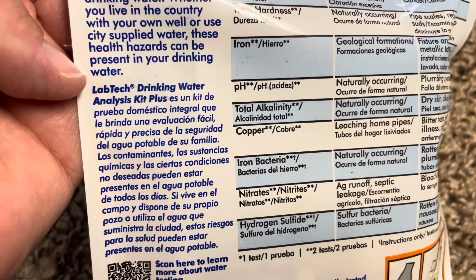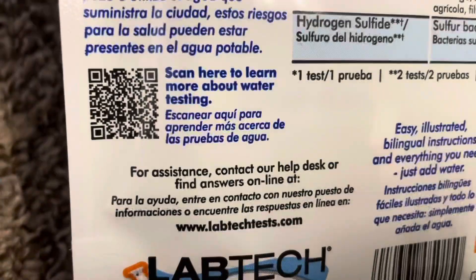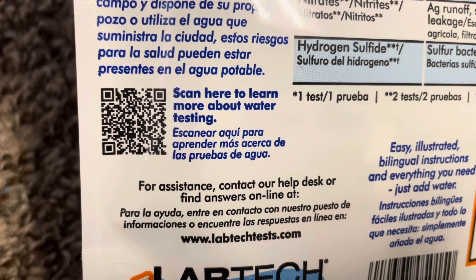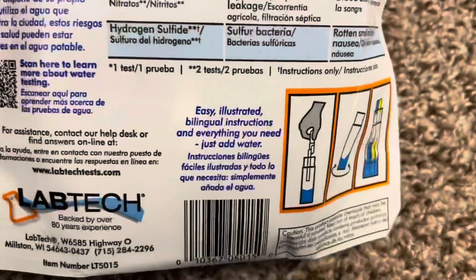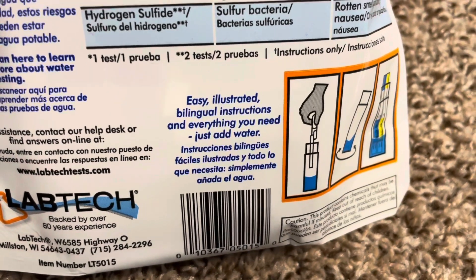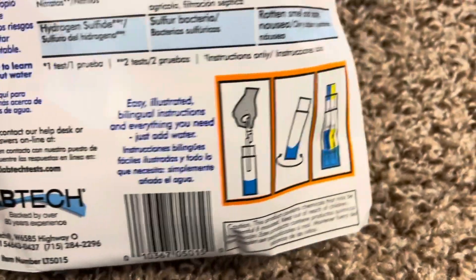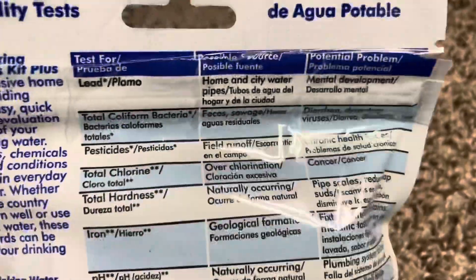This is the Lab Tech Drinking Water Analysis Kit Plus. You can scan this QR code to learn more about water testing. Easy, illustrated, bilingual instructions and everything you need — just add water. Looks pretty easy enough. This is going to be the first time that I am doing this.